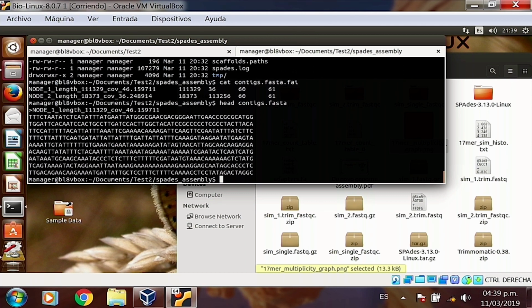The third one is called the byte offset. Basically, it's telling me where within the document the sequence actually starts. When you see a 36, it means that the first 35 bytes of the document don't have any actual sequence information.